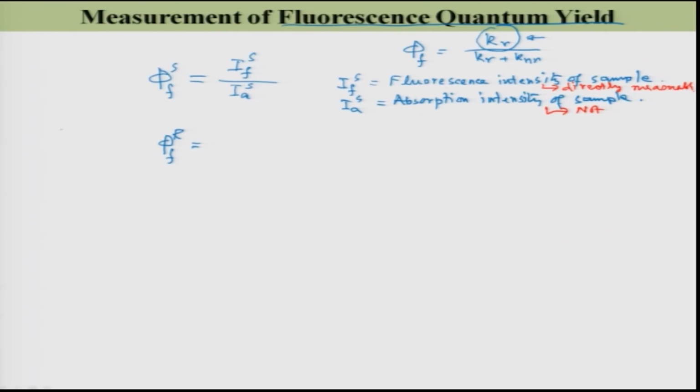So, here I will write the known fluorescence quantum yield of a molecule referred to as the reference molecule.